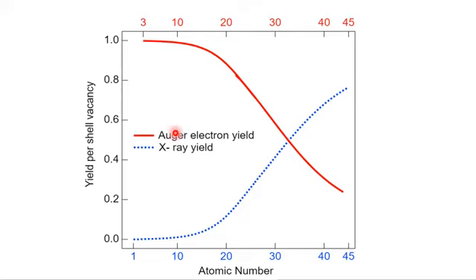Since you know that Auger electrons are tertiary electrons, when an energetic beam of electrons is incident on a K shell or core shell electron, that core shell electron is ejected, and an electron from a higher energy level like the L shell will jump into the core K shell. During the transition of the L shell electron into the core K shell, the K alpha X-rays will be ejected.